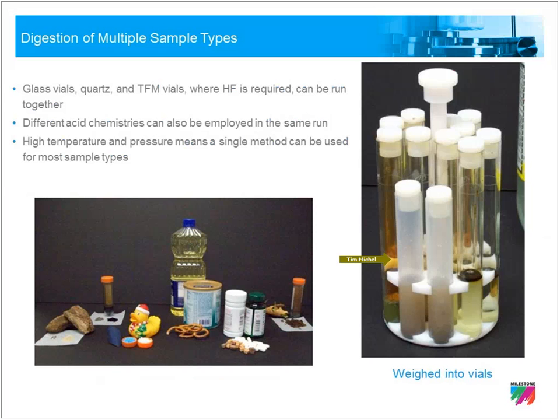Of course, that brings up one question that we often get. If you're doing all those samples, how do you know what microwave program to use? Our advice is to determine which sample is going to be your most difficult, which needs the most rigorous sample preparation method. Use that one. You can't overcook the samples that digest at lower temperatures. If you use the highest one, you will ensure that you get complete digestions of the complete range of sample types.